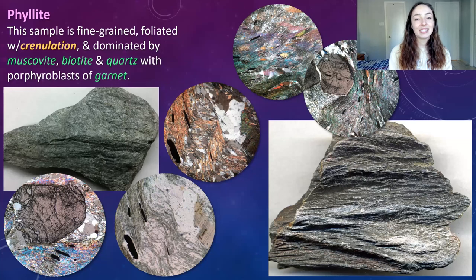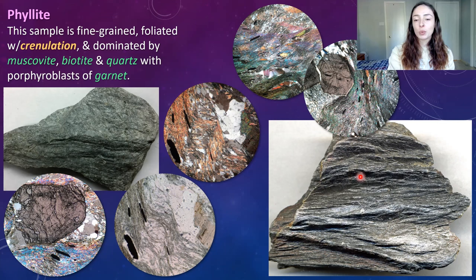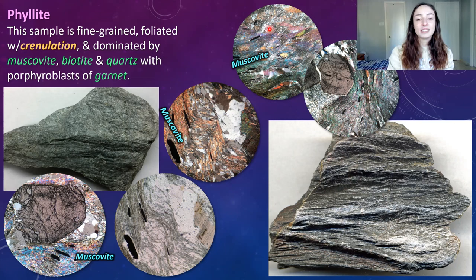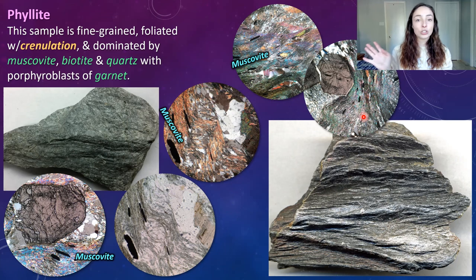Phyllite is the next metamorphic rock we'll look at. This is a fine-grained foliated rock with crenulation. Crenulation is just the highly folded, wavy foliated texture of phyllite. This thin section, as shown by these five images, is dominated by muscovite, biotite, quartz, and porphyroblasts of garnet. The muscovite in each thin section is the extremely foliated mineral that is rainbowish in color under cross-polarized light, present in all of the labeled samples.